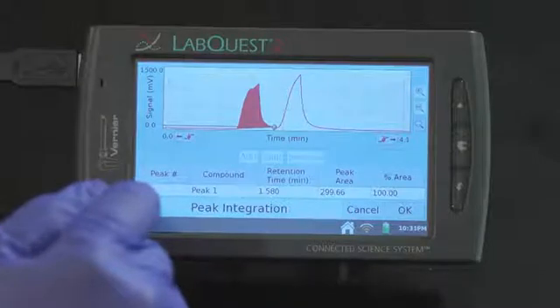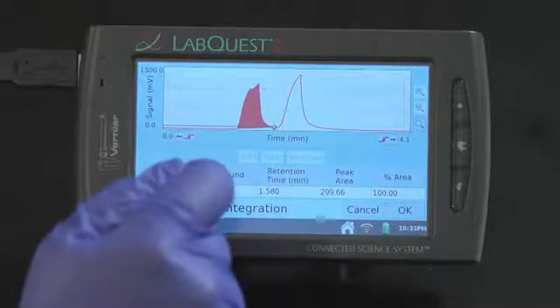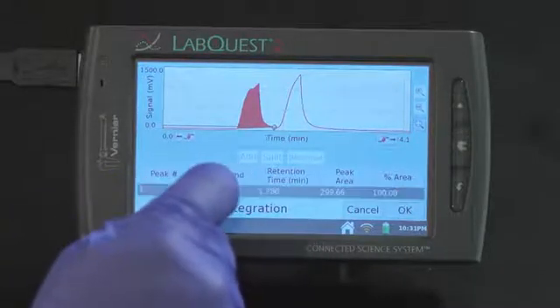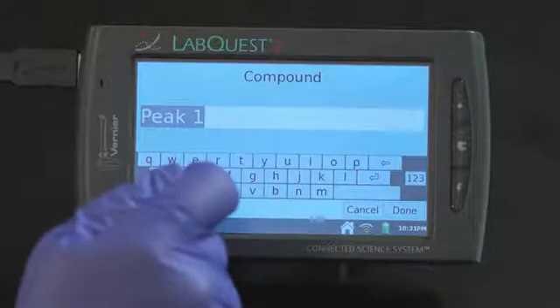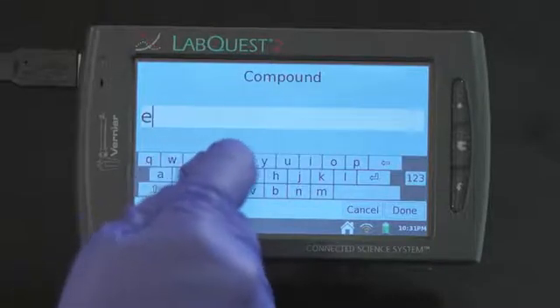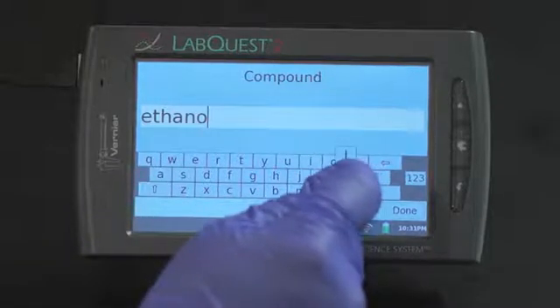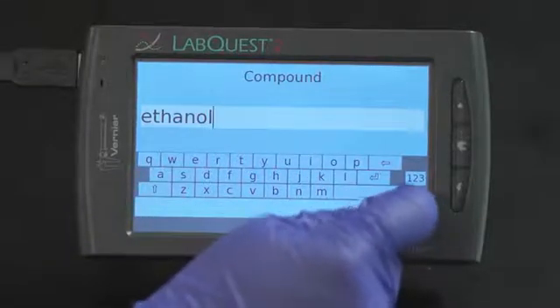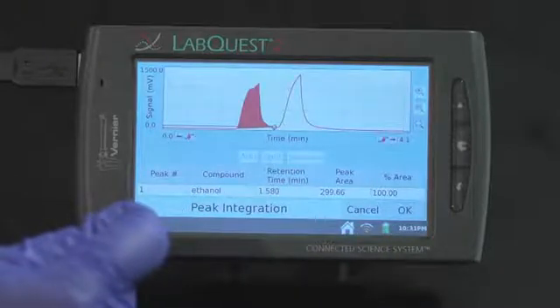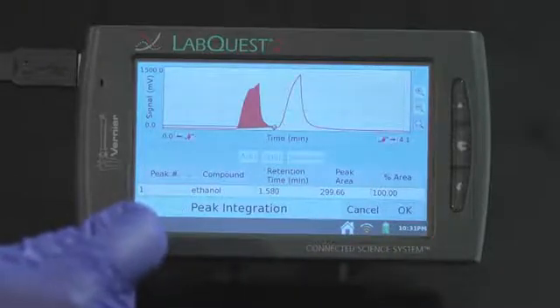Enter the name of the compound if known. Tap twice on peak one and type in ethanol. Choose Done. Repeat these steps until all peaks have been analyzed.